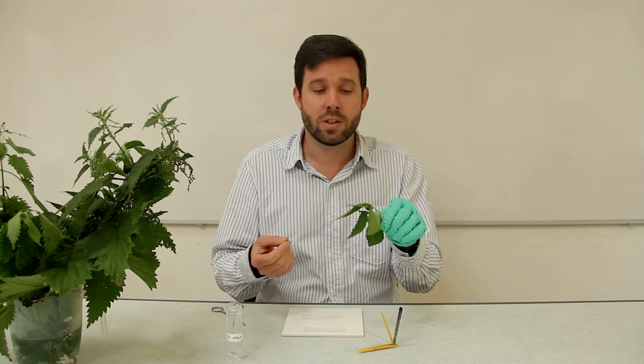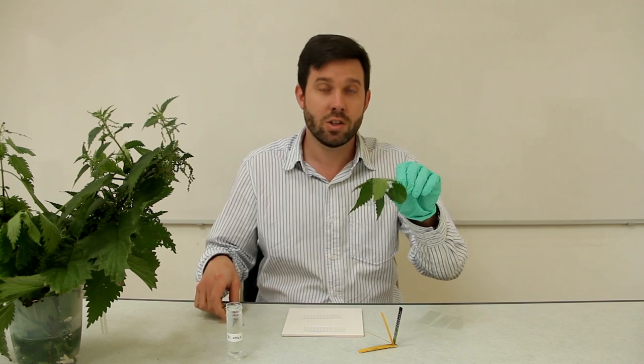It's a really simple investigation for students to do. All they need to do is grab a stinging nettle leaf — you should be able to find a stinging nettle somewhere in your school grounds, they're everywhere.